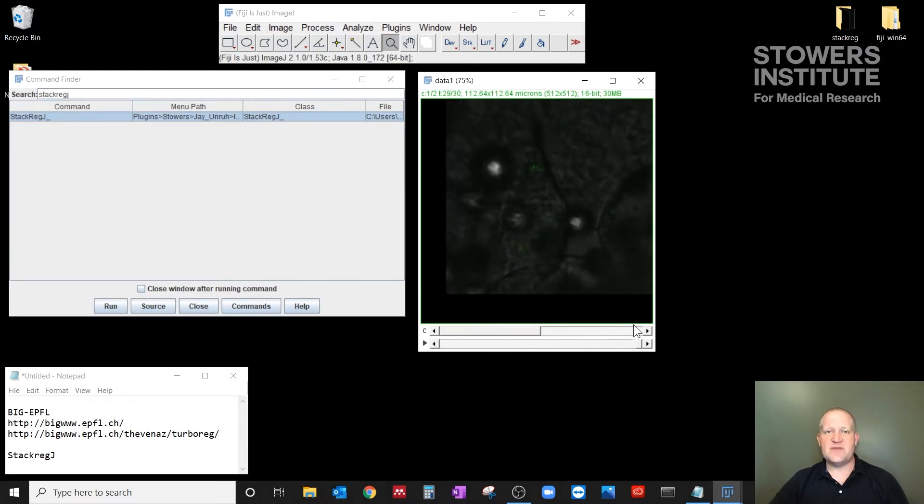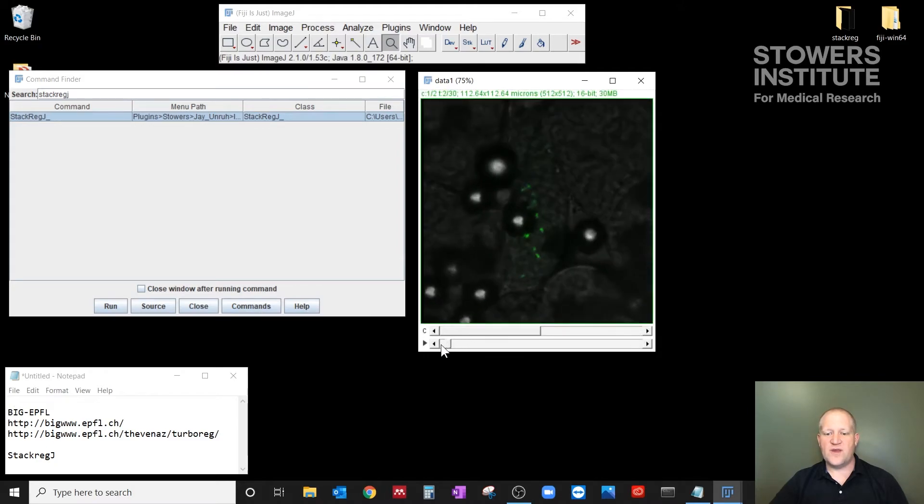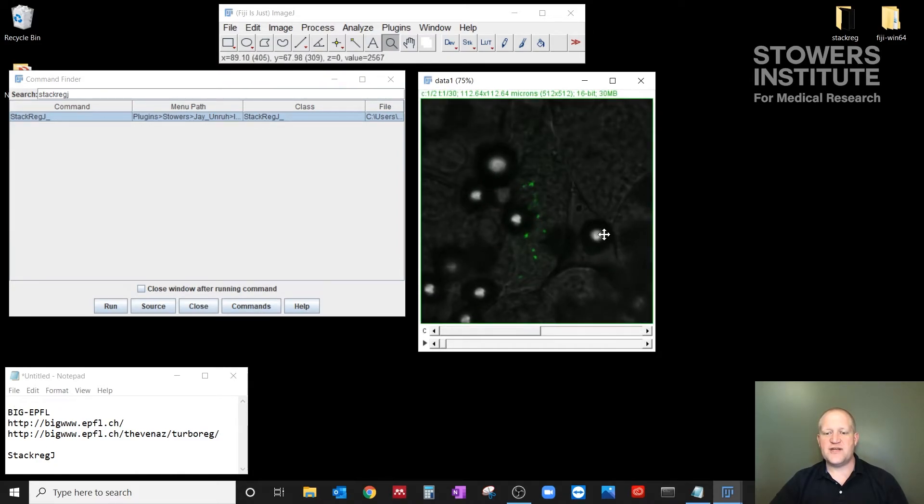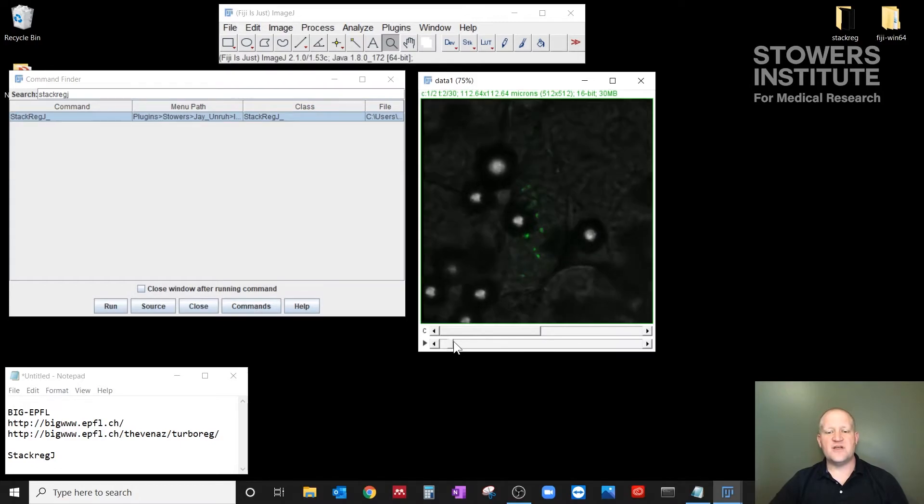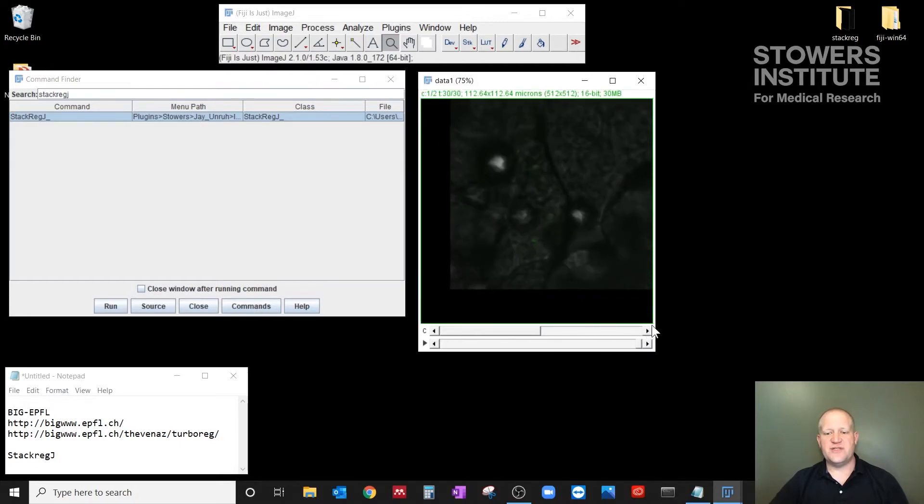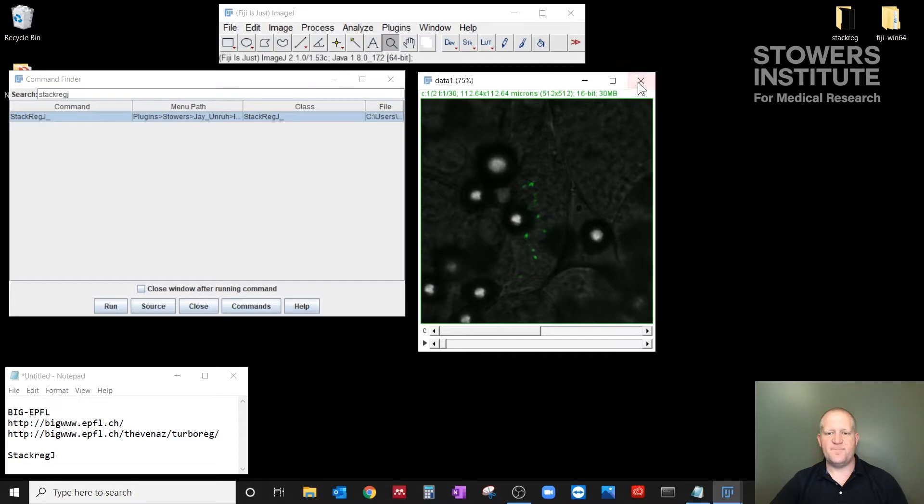Okay, and you'll notice that the transmitted light was registered along with it. If I had started with the transmitted light, it registers on bright objects. So these bubbles that are in the media would have caused major issues if I had used the transmitted light. But it does register both channels at the same time.